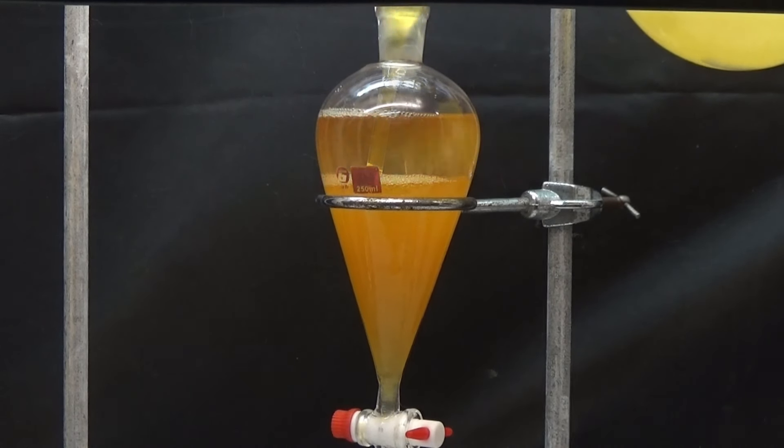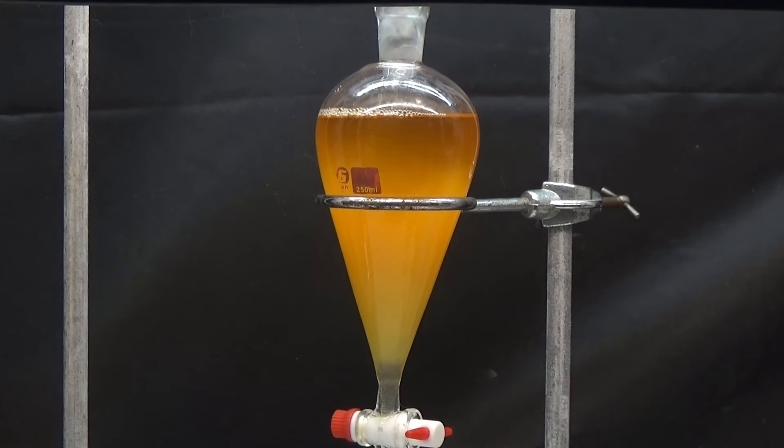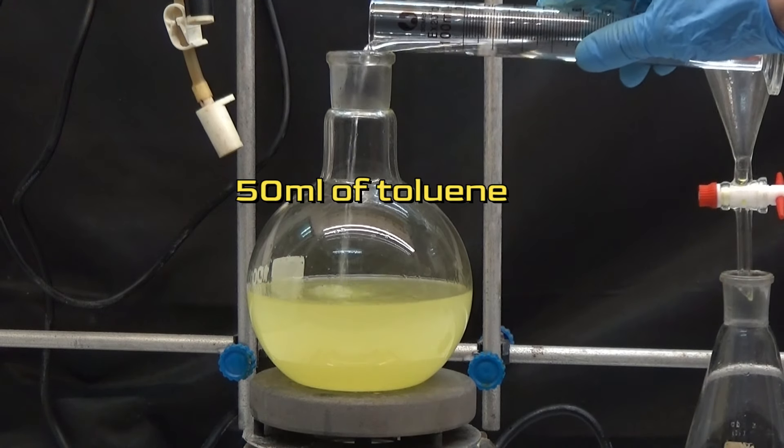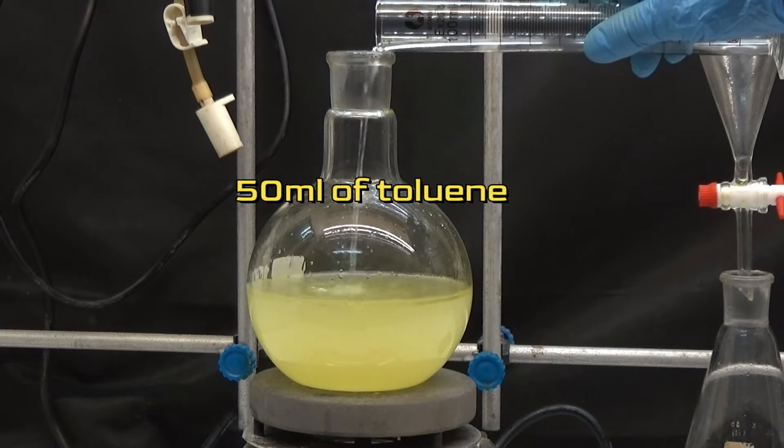Separate the aqueous phase from the organic phase using a separatory funnel. After washing the aqueous phase with 50 milliliters of toluene.